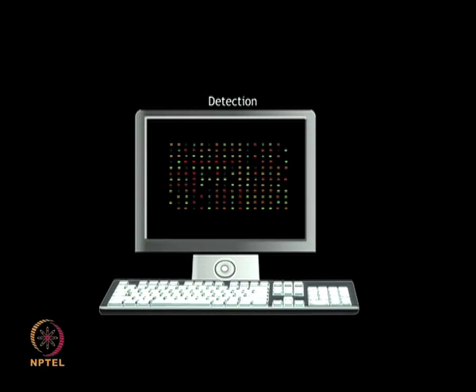Author detected 47 immunogenic proteins, one of which showed response in 11 of the patients. This protein microarray platform was successfully used for detection of several other disease biomarkers, and this is one of the applications which is shown in this animation.